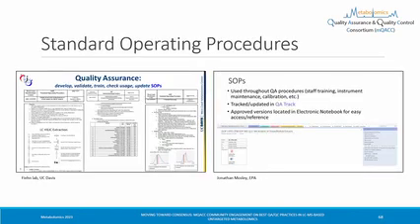This was, I think, one example that goes a little further than most in terms of actually integrating and using that data. SOPs: Oliver Fiehn from his group was very kind and sent some slides related to how he considers SOPs. What makes a good SOP? It's the inclusion of all steps, a pictorial workflow, all reference materials, how to do data analysis. Everything is in one place, right? So you know if you're going into the Fiehn lab, you're going to be resourced with decades of knowledge, and they're all documented. This is certainly good for driving efficiency at any scale, right? Even if you're a PI-driven small lab, this means efficiency for the next starter. You don't have to train them up from zero.